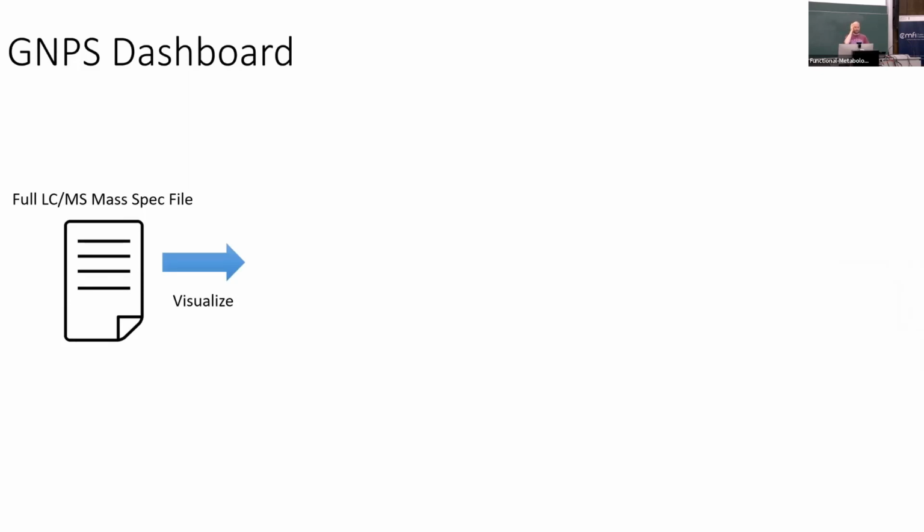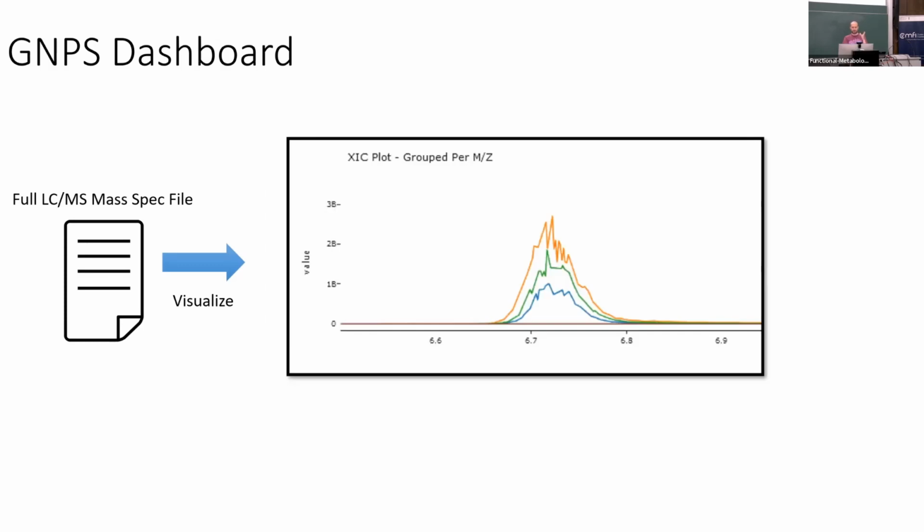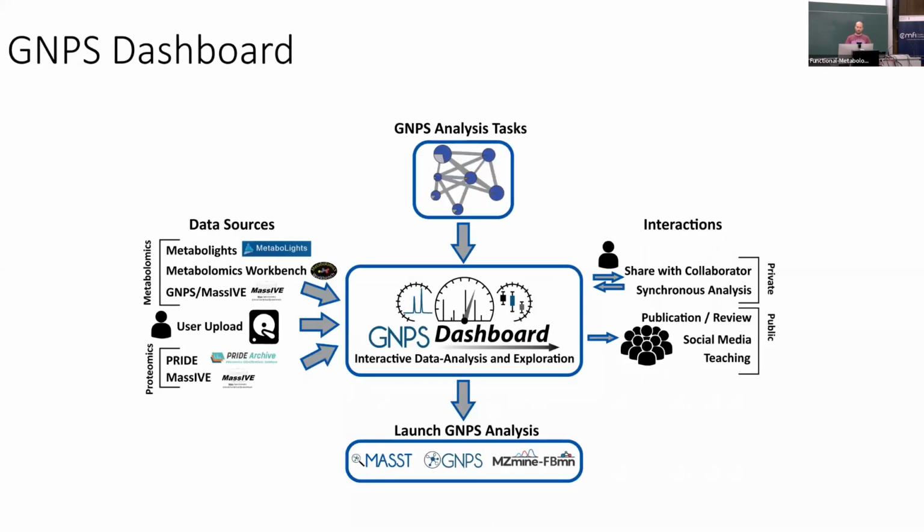It's pretty simple. We just want to throw in an LCMSMS file, typically in MZML file format, into the web browser and then get an XIC. That was the first idea when Ming and I came up with it, to have this visualization just as a quick output of the molecular networking jobs we were working with. And since then, once Ming got excited about it, things developed very quickly, and more functions came to the dashboard.